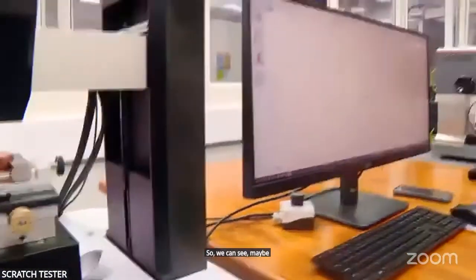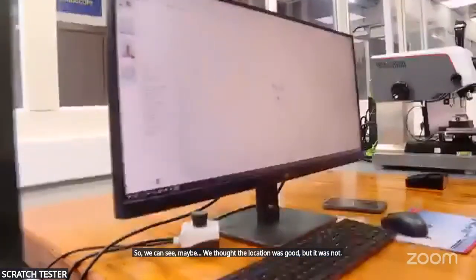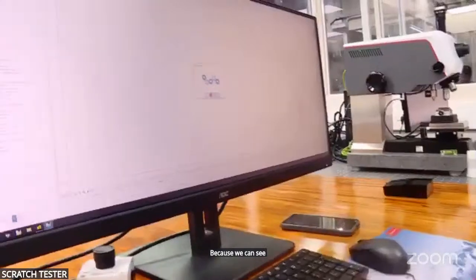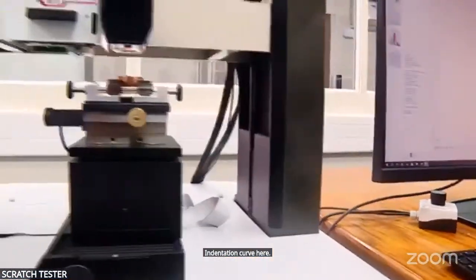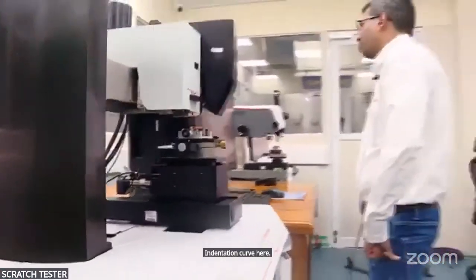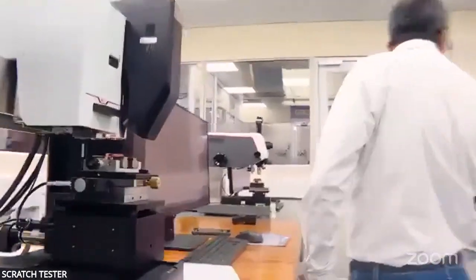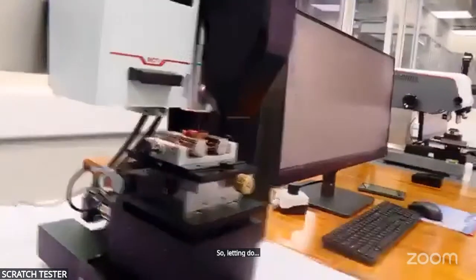We can see maybe we thought the location was good, but it was not, because we don't have a good indentation curve here. So let it do. Something happened, I don't know what.